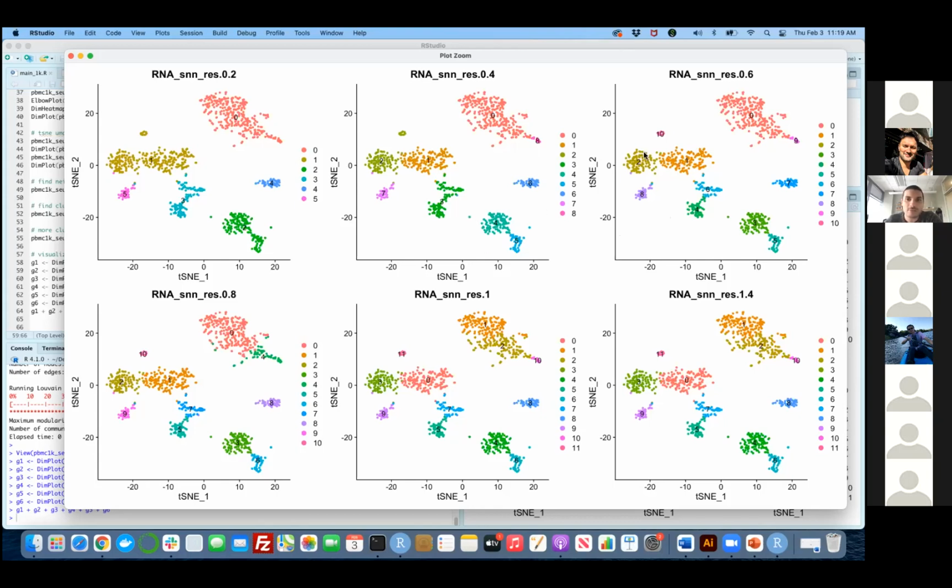So basically what I'm seeing here is that this one actually was separated into 2, but nobody actually told me about the small cluster over here, which was considered a part of this cluster 1. It was so close to these 2 other clusters that it was considered a part of them, but it was apparent in t-SNE that it could be a different cluster, and it's actually picked up as I increase the resolution. So the correct one is 11 or 5 or 6, sorry. What's the correct one?